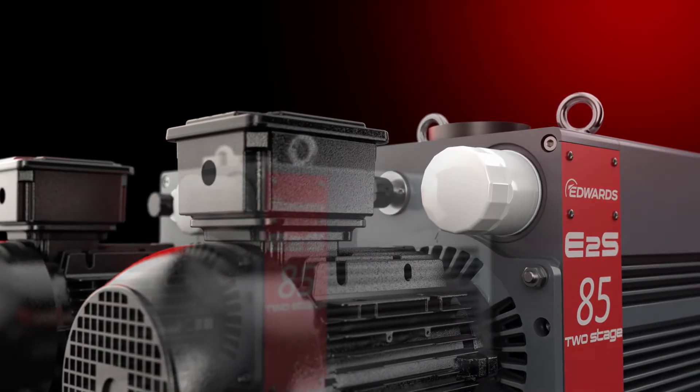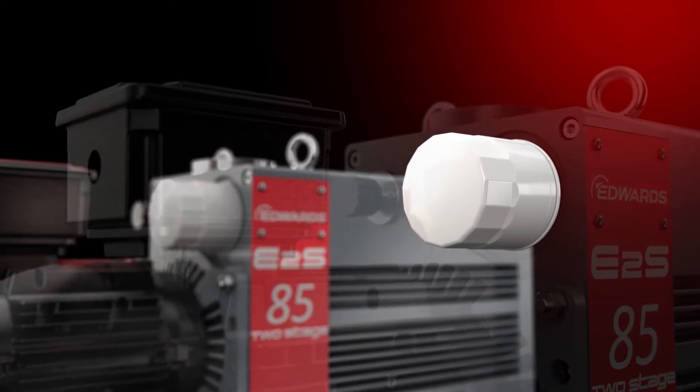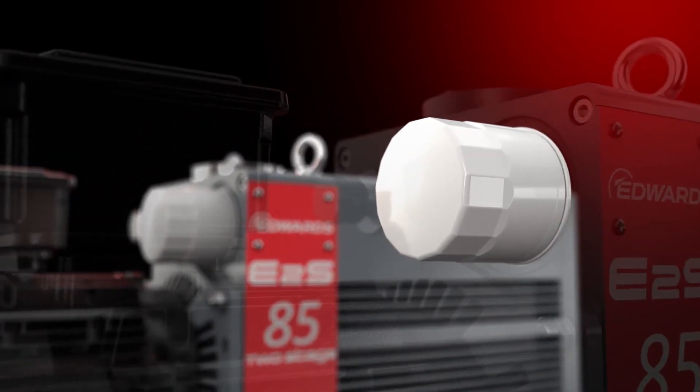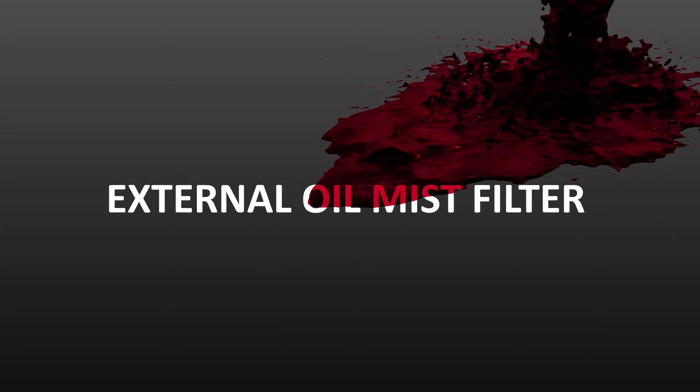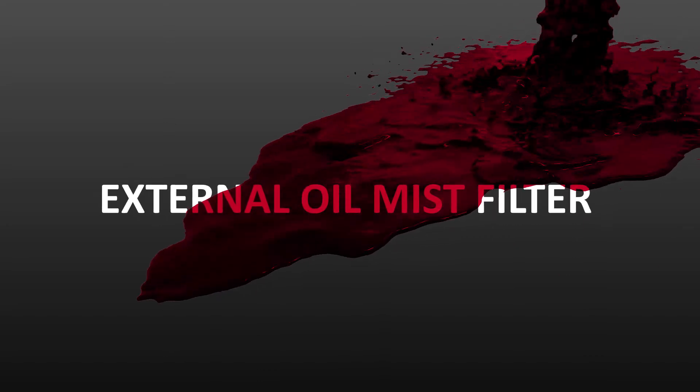What is special though, is its oil filter. This premium feature keeps the oil clean for longer and prevents contamination or leaks. And the optional external oil mist filter means no need to worry about oil in your production environment.